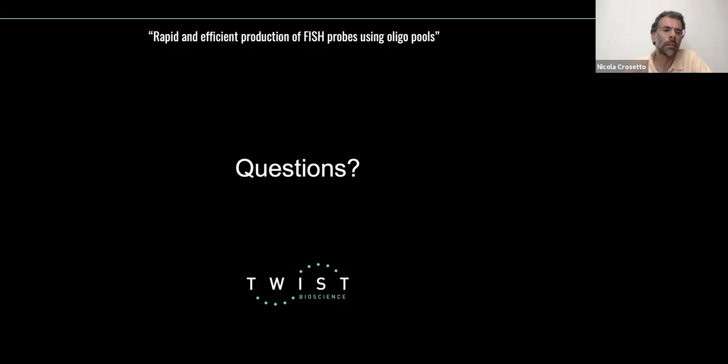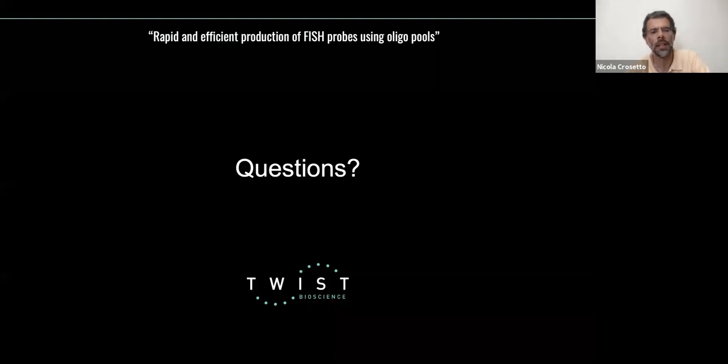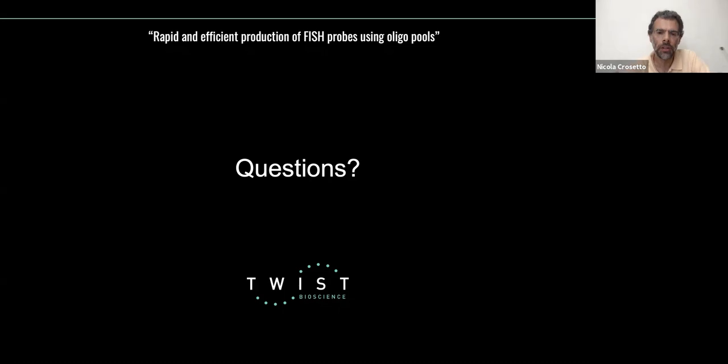If you care more about really quantifying the signals, for a more diagnostic application, you really want to avoid this, because you will not know: is it a real signal or is it a false positive? So there, better go with a larger region where you have many oligos, and you will not end up with this problem.